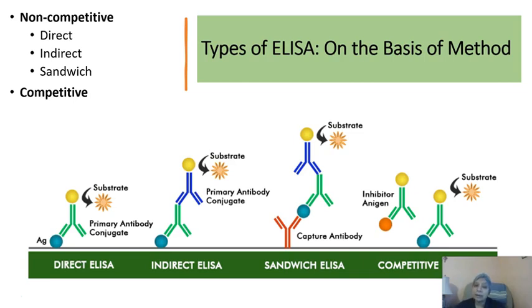Many times, direct as well as indirect ELISAs are limited to proteins where you have a lot of them, frankly, or to simple mixtures or simple samples. When you have complex systems like your cell extracts that have thousands of proteins, lots and lots of them with lots of background, essentially, it is going to be really hard to get your protein of interest to work very well with them. In those cases, what instead we want to use would be something called sandwich ELISA.